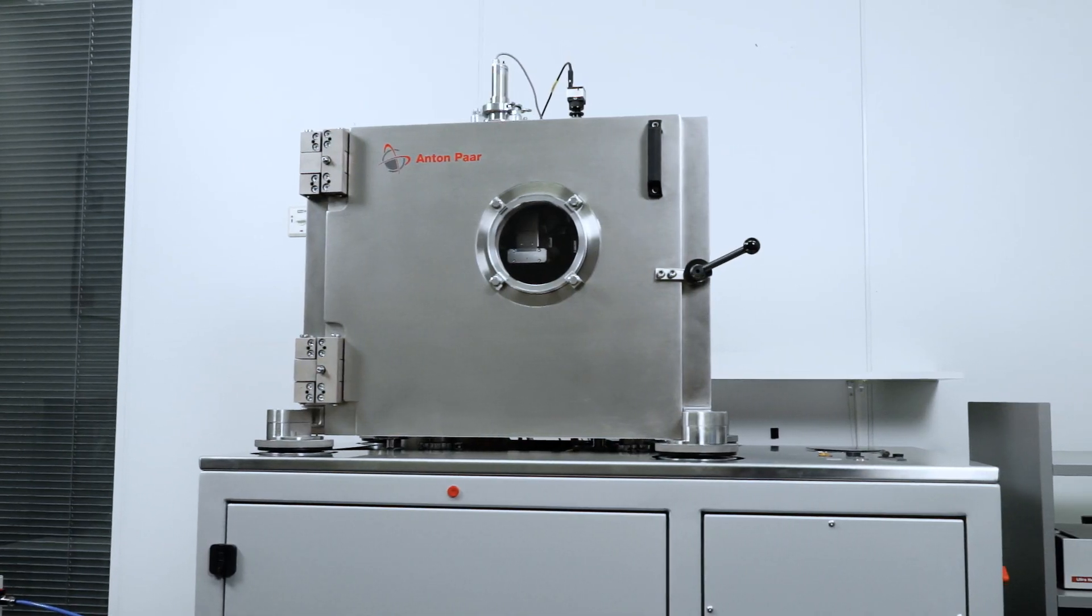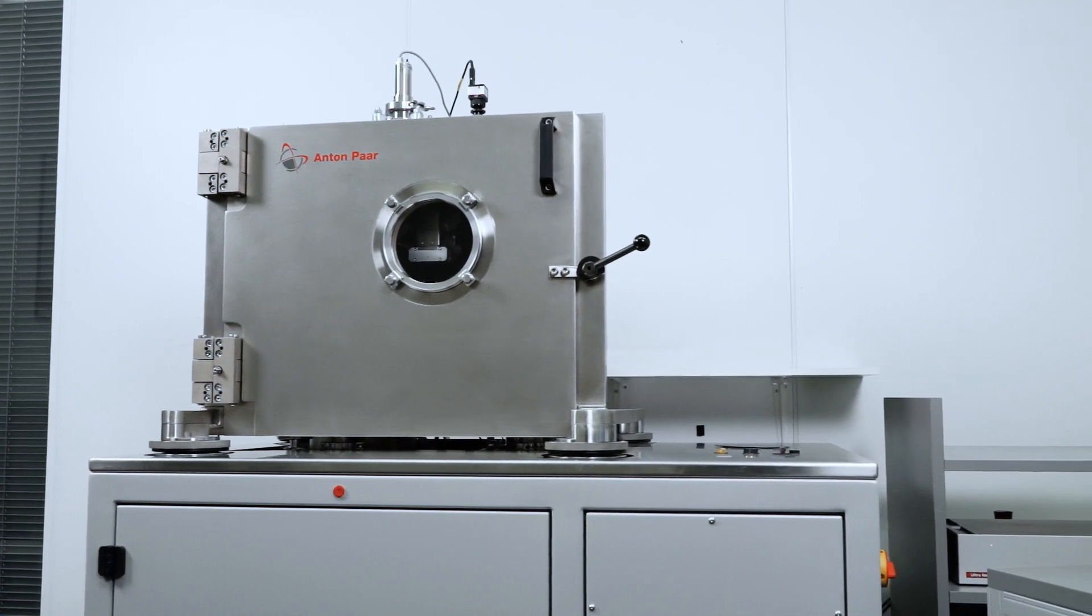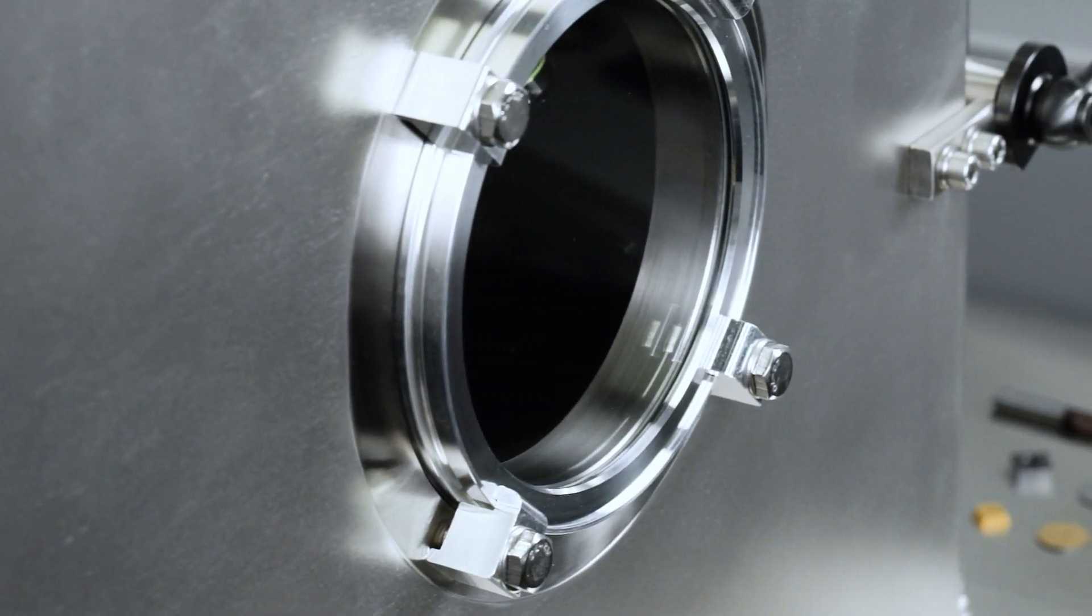The high vacuum system is based on a 5-axis magnetically levitated turbopump and avoids oxidation of the sample and indenter tip.